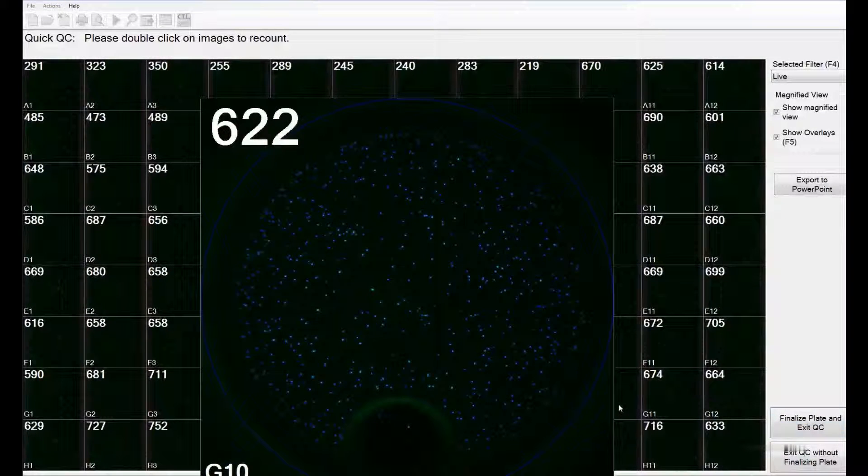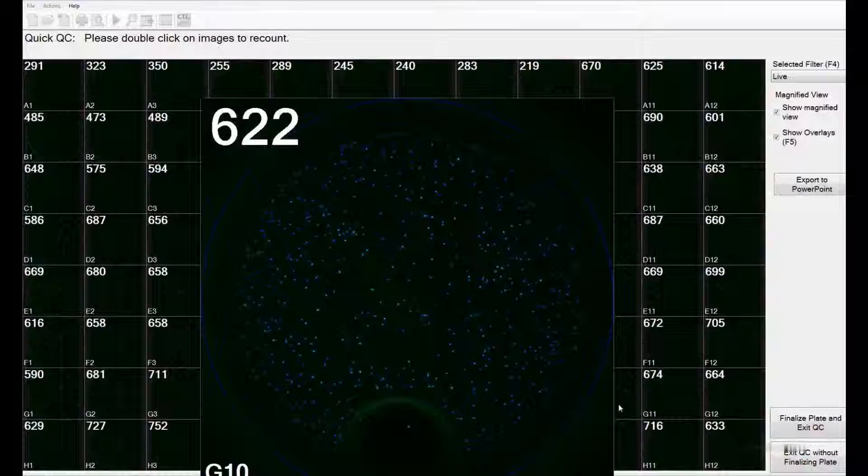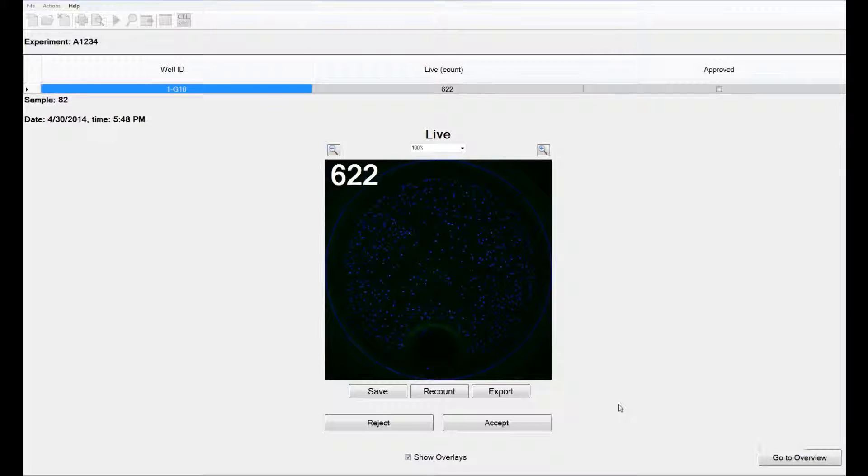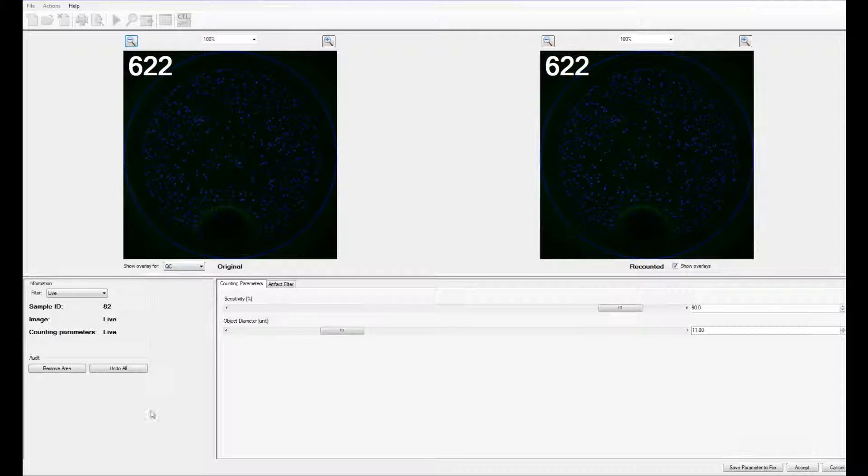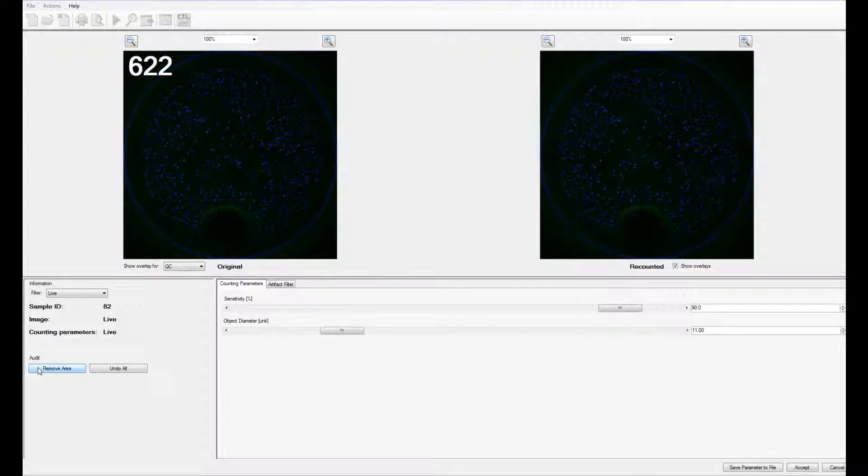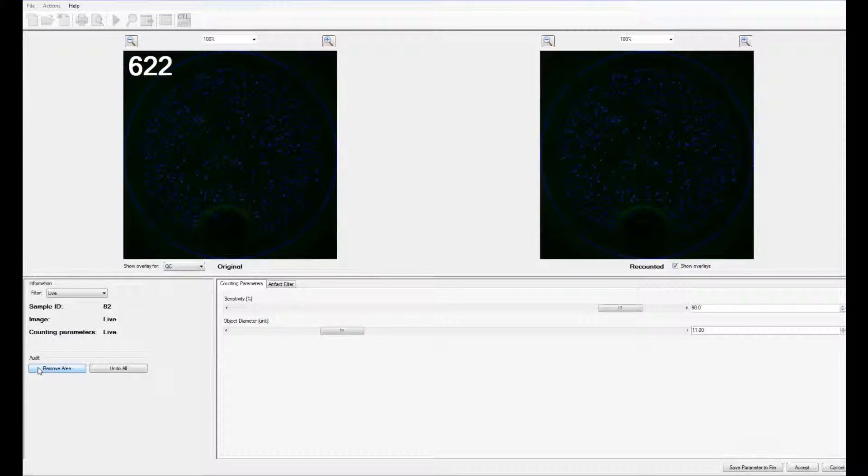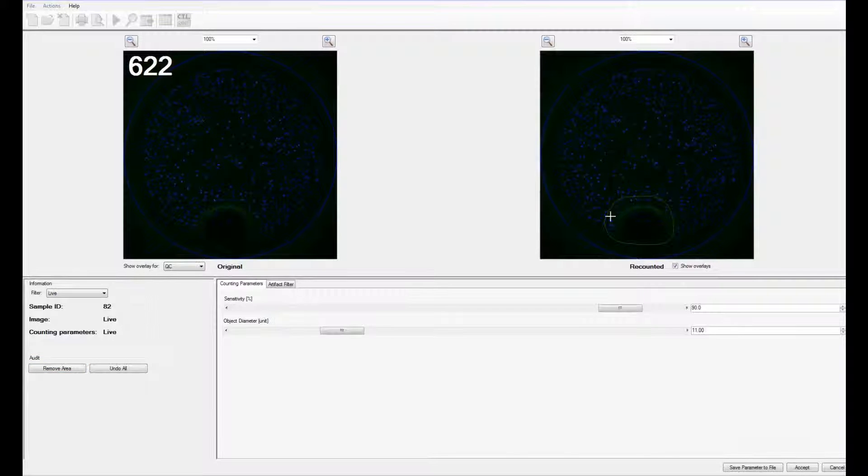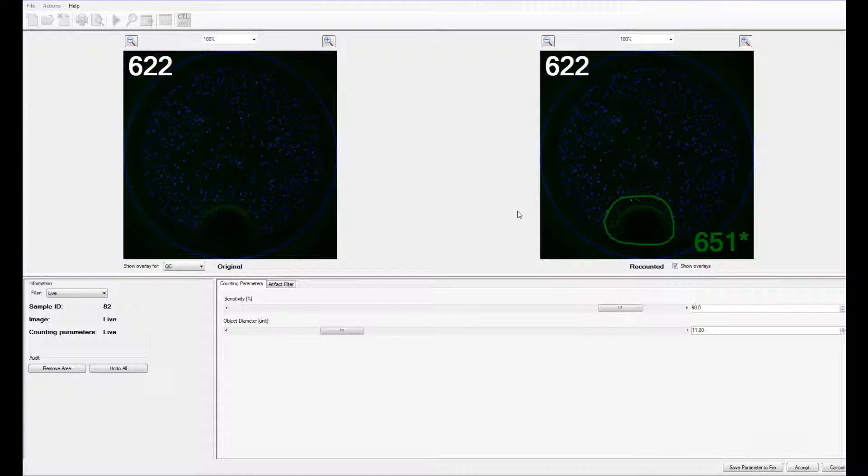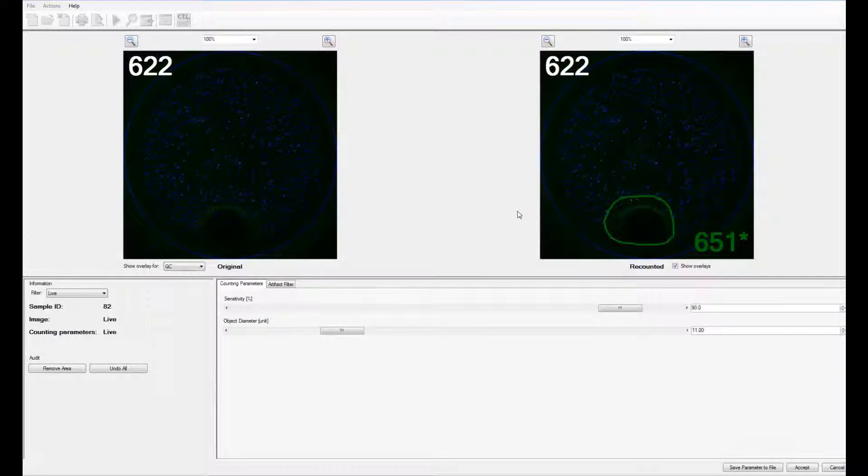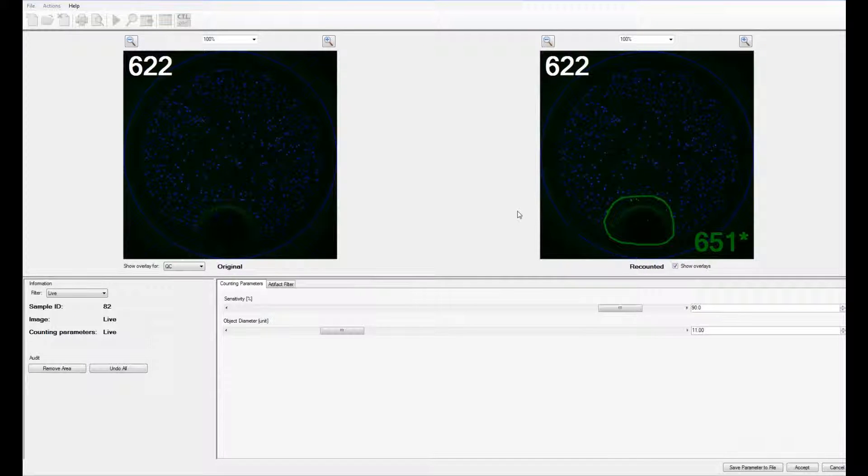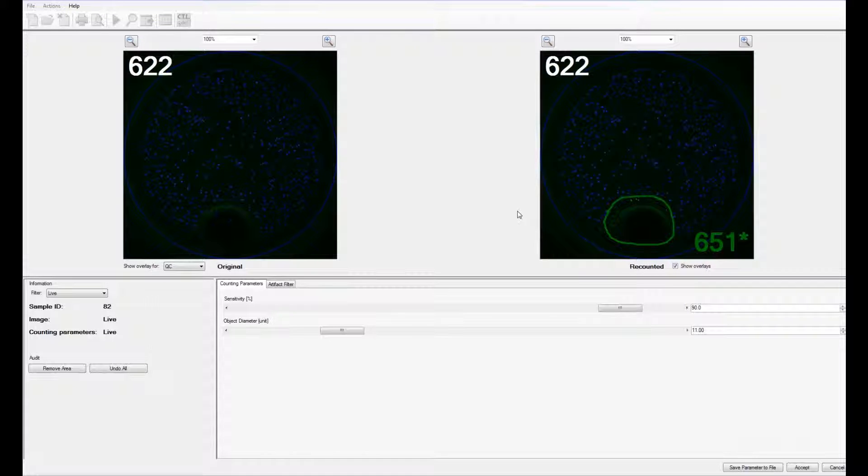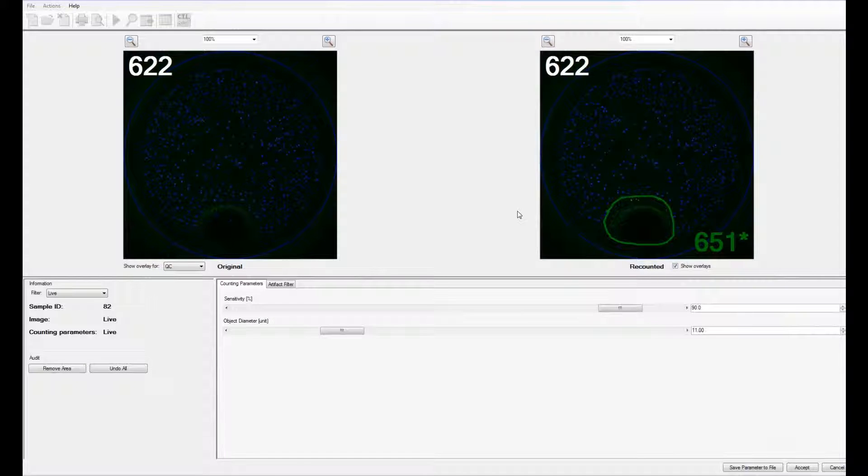If there is a well that you would like to recount, you can double click on it to launch the quality control mode. To remove a portion of the well, say to exclude a fiber or a bubble, just use the remove area icon. You can then circle around the object you want to remove. The software will recount the cells in that chamber, removing the area, averaging the cells in the remaining area, and then normalizing it to the total area again.